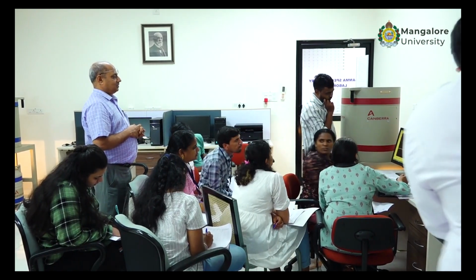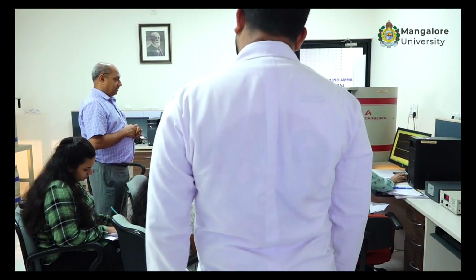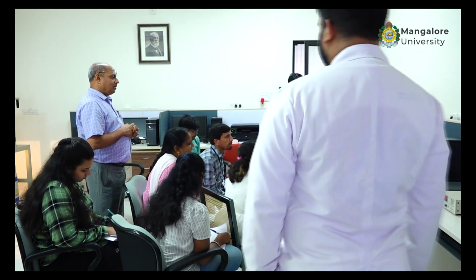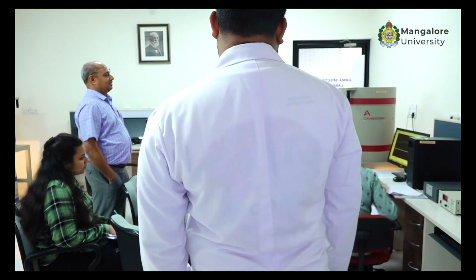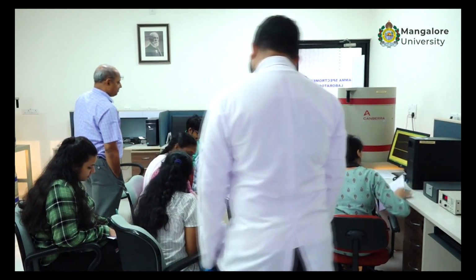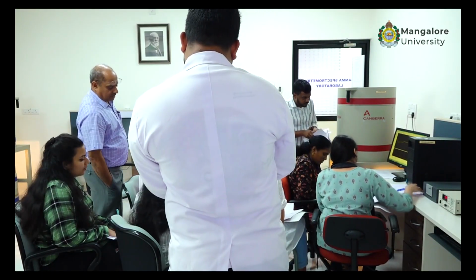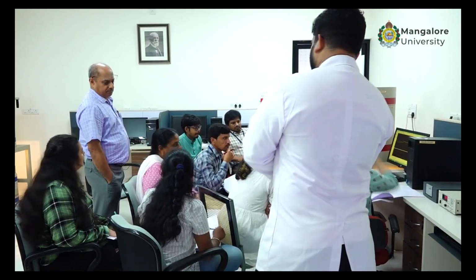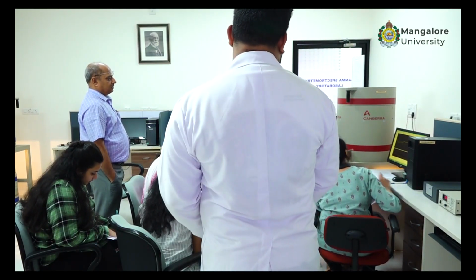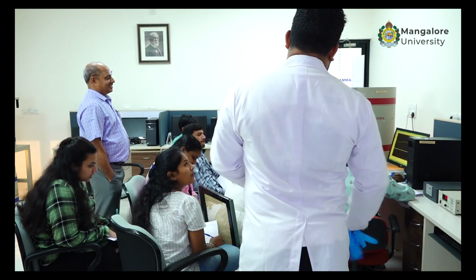This one 59.6. Ratio. Which one? 59.6. Yes. So note, if it's not there, you write down. You can note. Just note down the energy. No, it has a gamma also. We need to check everything. The book. We need that count also. Yes, we will have.